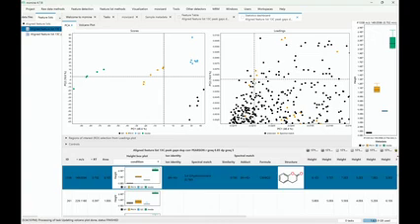So if I select anything in the volcano plot, it is also going to be selected in PCA. And sometimes I feel that's quite interesting because, you know, in volcano plot it's very easy to compare two groups, but maybe you also want to see how does it map in the blanks in other samples, so you can have the univariate and multivariate statistics basically combined in an interactive dashboard.